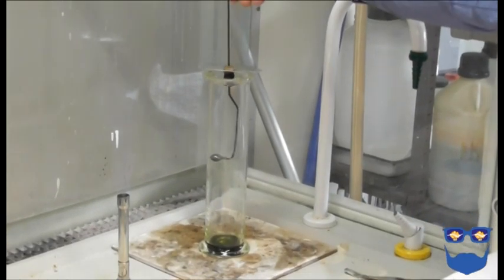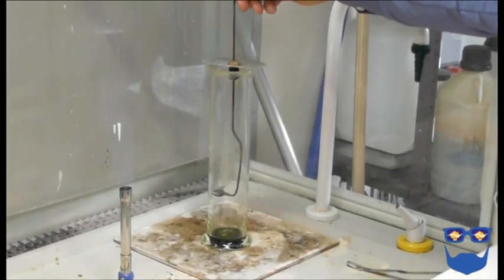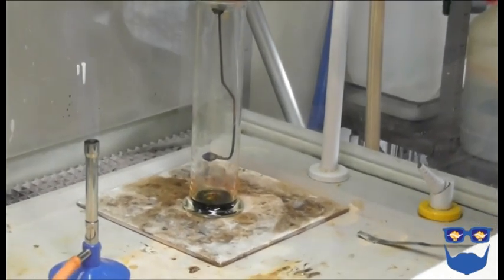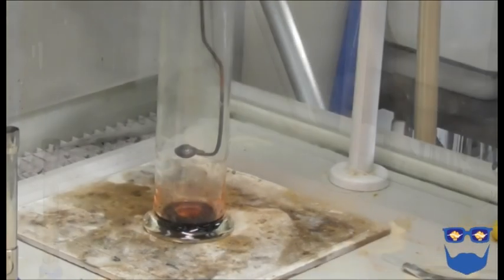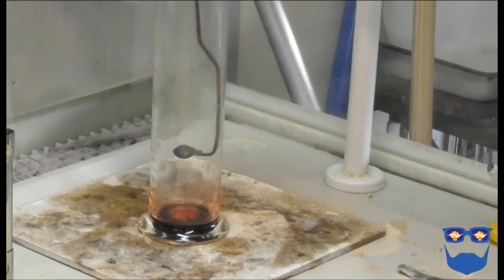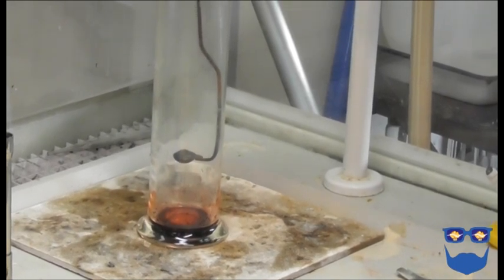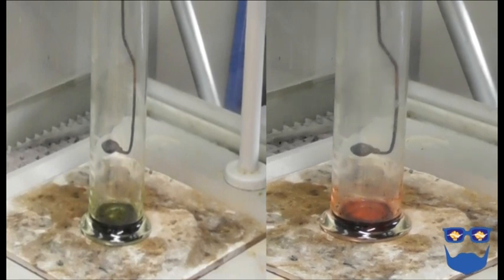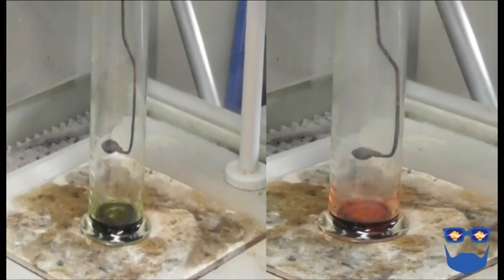Place the deflagrating spoon into the gas jar and observe the universal indicator. You should see the green color turn red as the gases in the gas jar dissolve in the solution and produce a strong acid.